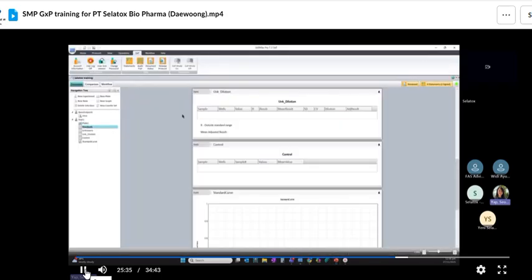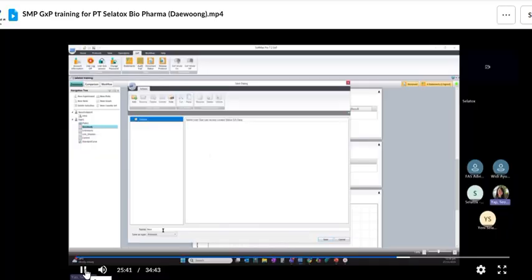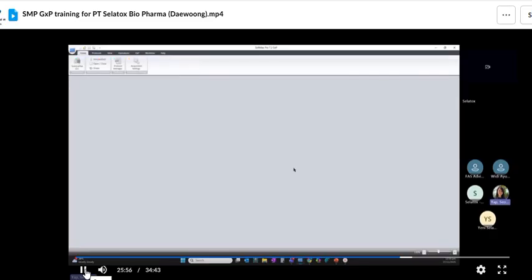Okay, or any time point, if the file is this version no longer active, you can change it. Yeah, you can update it. Yeah, so you save as a particular folder. Yeah, maybe this is project A protocol. Save somewhere if needed. Okay, project A, release it as a protocol.